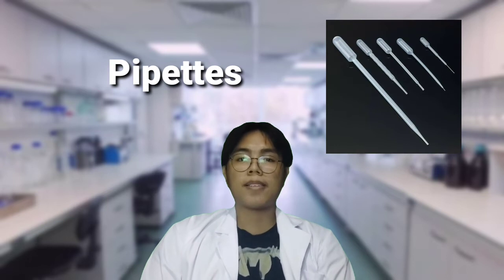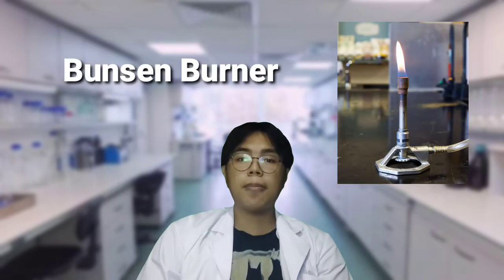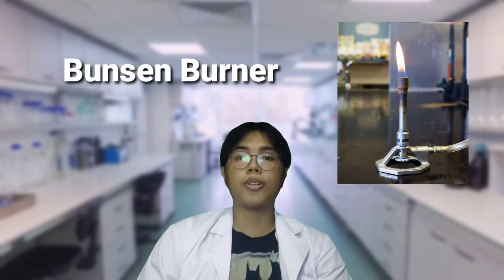Erlenmeyer flasks. These flasks are useful for holding liquid substances or for containing reactions. They are helpful for catching filtrates as well. Pipettes. Pipettes are used to dispense a small and accurate amount of liquid inside the lab. Bunsen burner. These are used as the source of heat inside the lab.